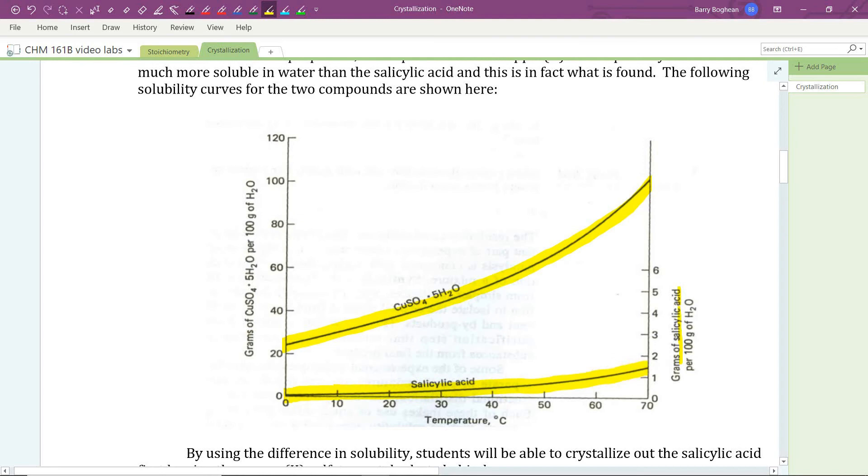Simply based on the solubility characteristics, we should be able to separate these two compounds. We'll do it by crystallization.